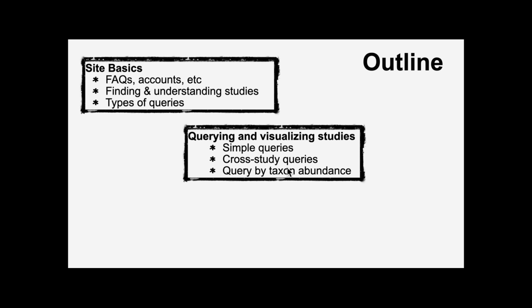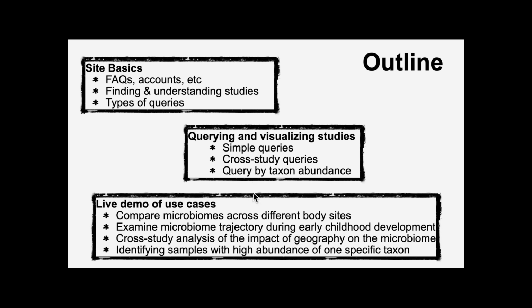And then at the end of the webinar, I will turn the steering wheel over to Wojtek Besant, and he will take some time to show you how you can upload your own data in the form of a biome file to analyze it privately in your own workspace. So we have two aspects of the site then. We have publicly available data we've already loaded onto the site for you to interrogate, and you can now load your own data.